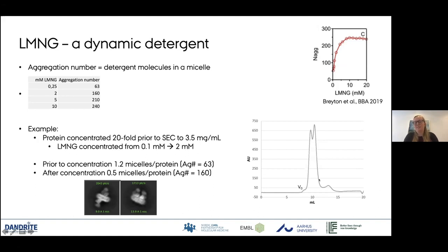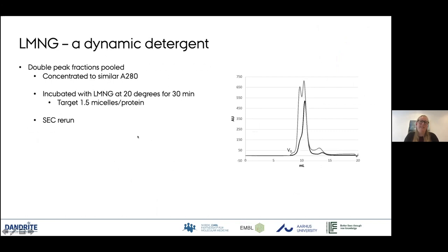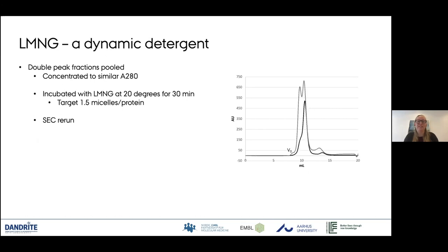The pattern I've seen many times shows a dimer peak and a monomer peak. Based on the aggregation number of LMNG and available micelles, it makes total sense that the protein forms these dimers. As an experiment, I took the double peak fraction, added LMNG targeting 1.5 micelles per protein for a small excess, incubated for 30 minutes at 20°C, and re-ran it on SEC. As you can see, it's a very dynamic process — I can actually resolve most of the dimers this way. It shows that even though I thought I had plenty of LMNG, the threefold increase in aggregation number really plays a role with this detergent.